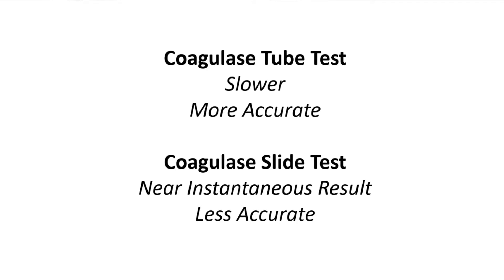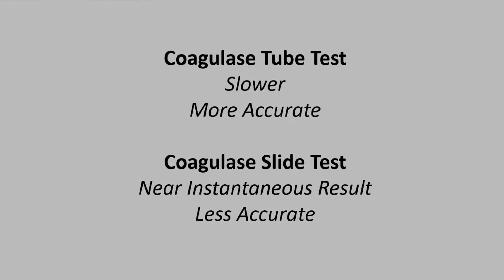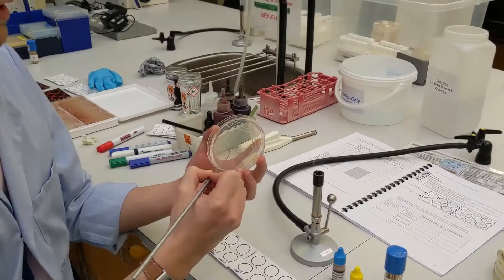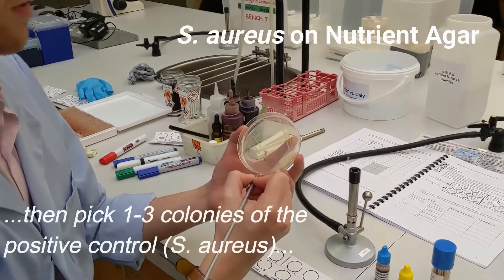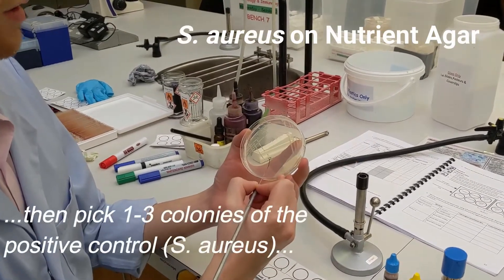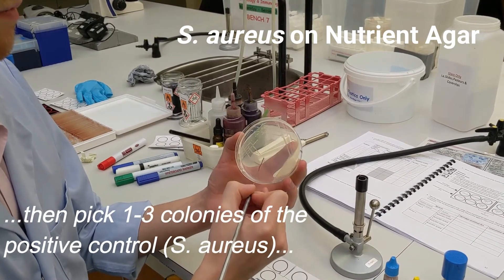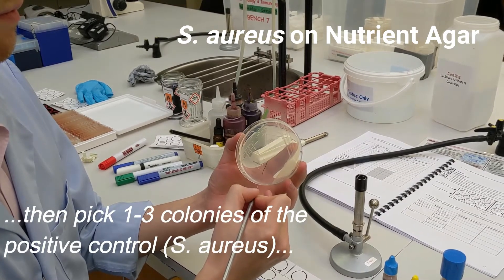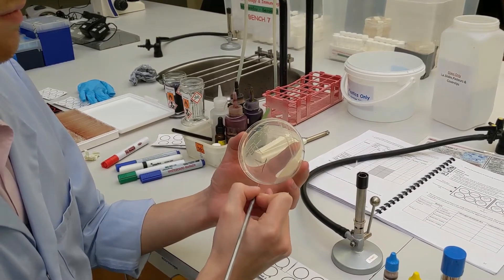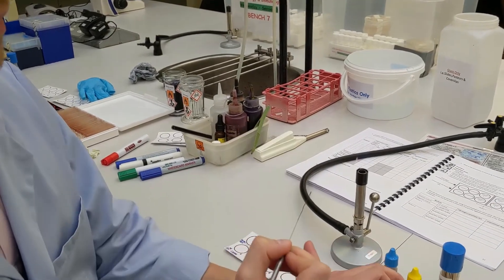Bacterial colonies are smeared on an agglutination card to which the fibrinogen-sensitised red blood cells are added. First, pick one to three colonies of the positive control Staph aureus, and smear these onto the agglutination card.